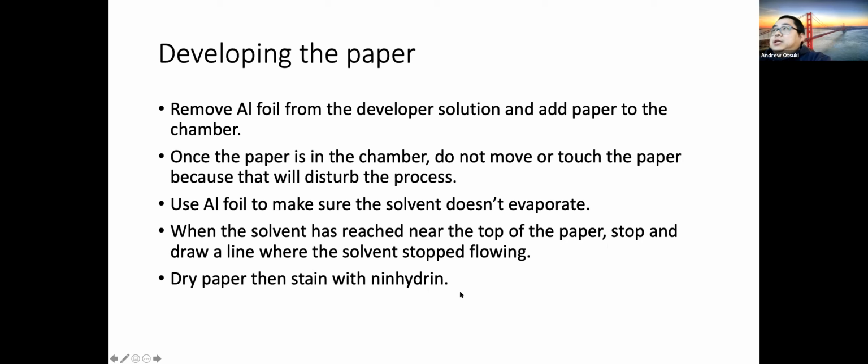Usually we do this in a fume hood, with ninhydrin, and don't get any on you because it'll stain your hands purple. I think when I was teaching for the first time, that happened to me. So students who try this, we caution them to not get any of this on their hands.